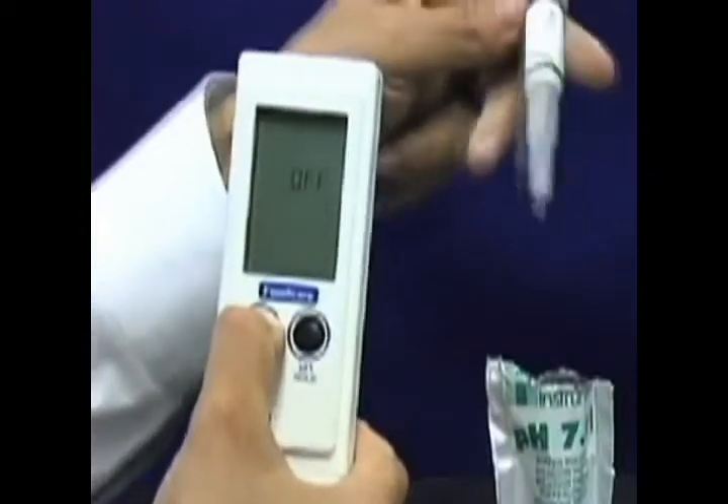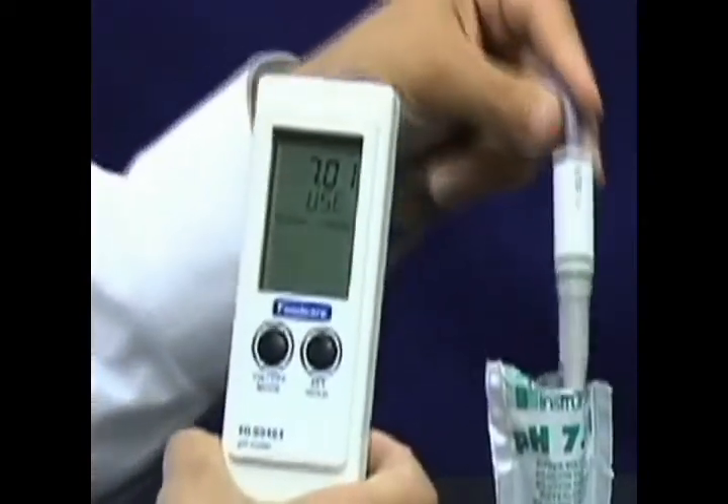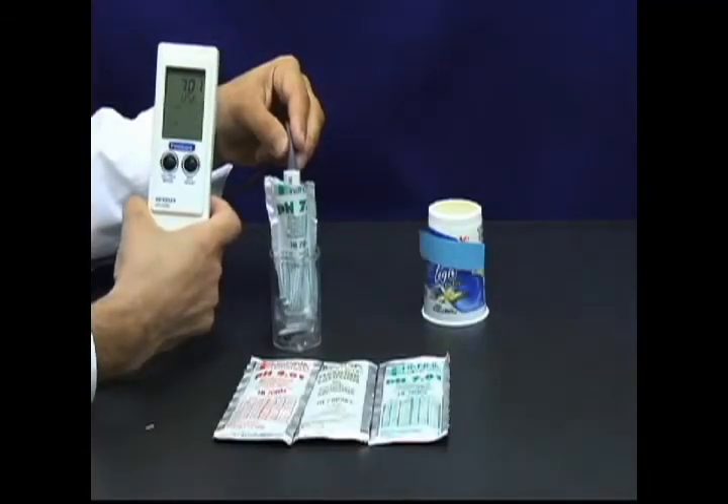First, we need to calibrate. To calibrate, hold the mode button down for three seconds until the meter prompts you to use seven buffer. Then, place the probe in the seven buffer and calibrate. It's that easy.